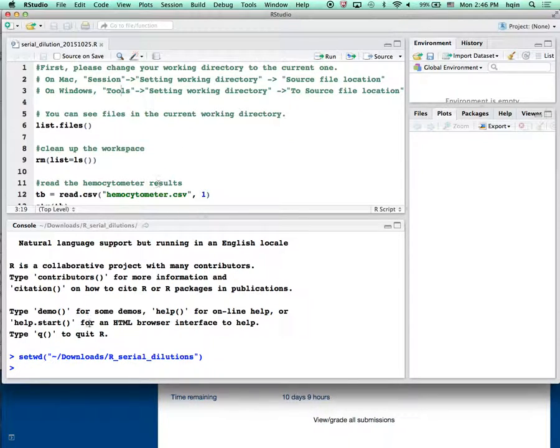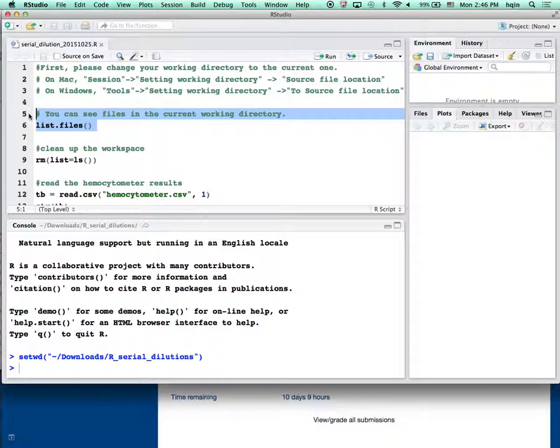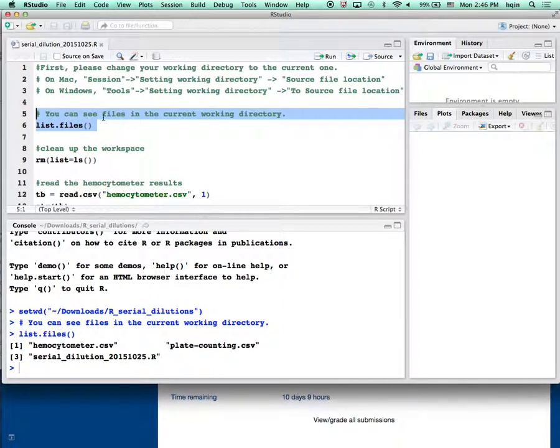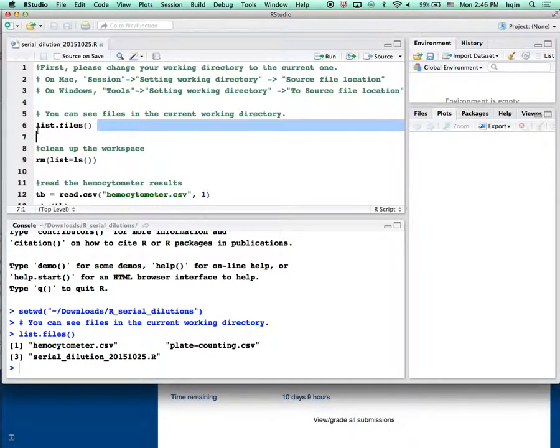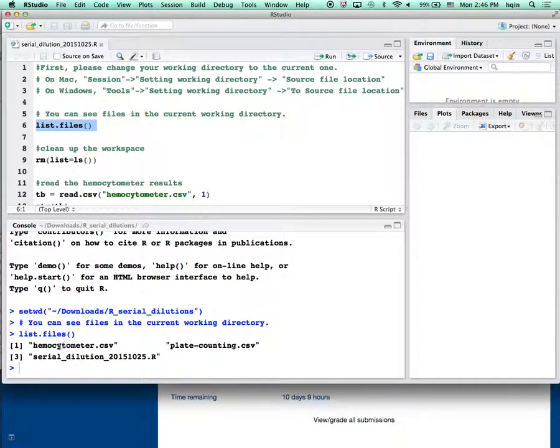I'm going to go to Session > Set Working Directory > To Source File Location. At the bottom you can see my current directory: Downloads > R serial dilution file. That's where I extracted the zip file. To verify I'm in the right place, I can see the files in my current directory. To run code in RStudio, you just highlight it then click Run.